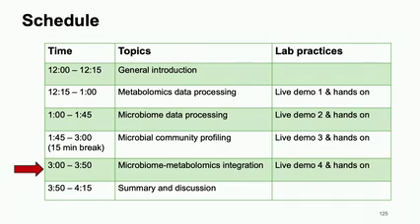In the demo before, when Yao did it, you can see alpha diversity. We do not see a lot of difference. The p-value is just marginal, and when you choose otherwise it becomes not so significant. The beta diversity is the same thing. We do this comparative analysis and all of them actually speak the same thing. They are not hugely different, but there are some patterns. It is common in clinical data that you do not see a huge difference. But more or less, they're telling you the same thing.